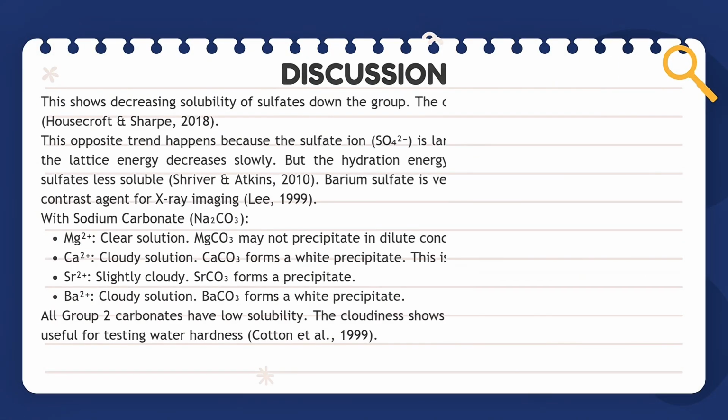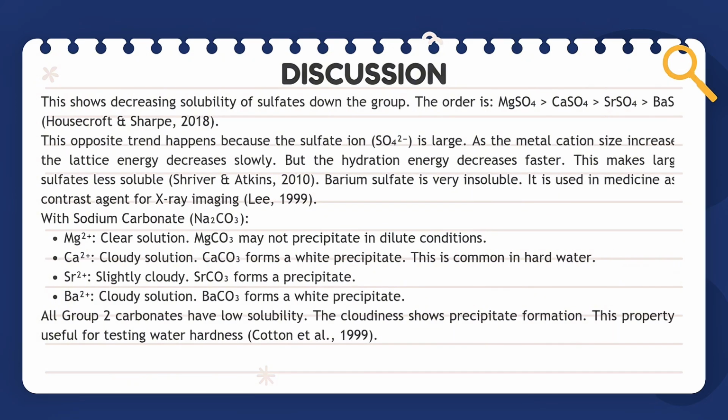Magnesium ion remains mostly clear under dilute conditions. Calcium, strontium, and barium ions produce cloudy solutions due to the formation of insoluble carbonates.